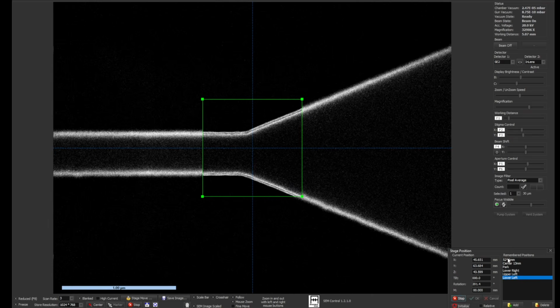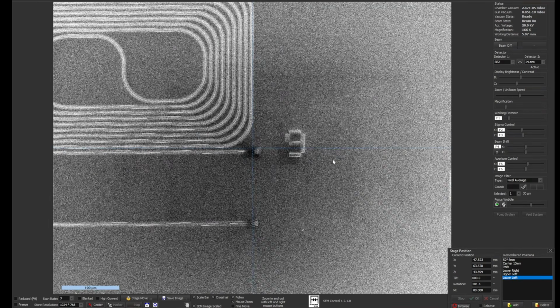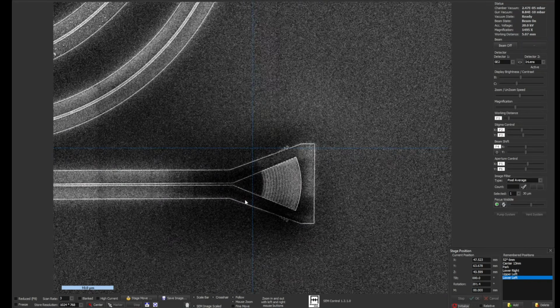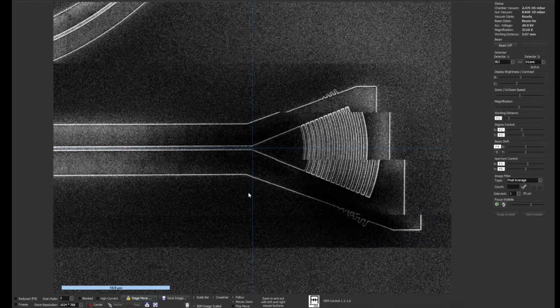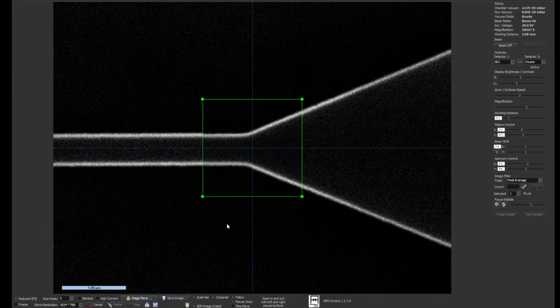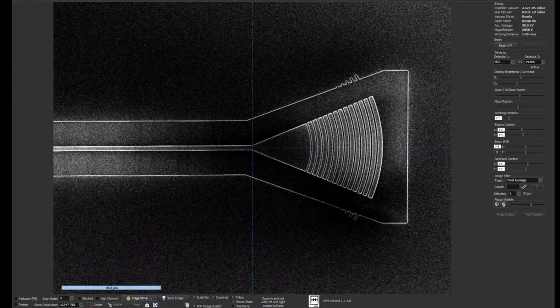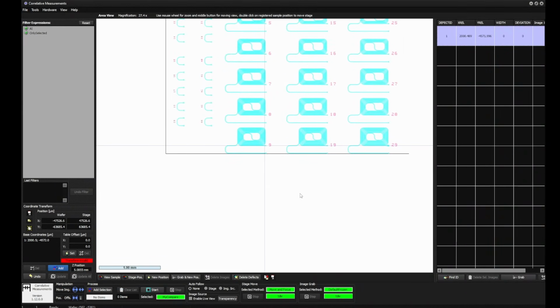We take the next point now, and this is similar. It's close to the number 9, and we go again to this position here, and I can do also some nice focusing on this position. Let's do the focusing. Like this is okay. Here is the number 9.